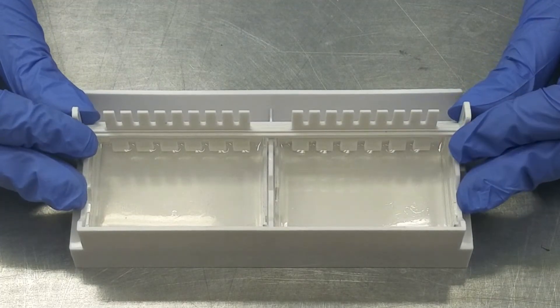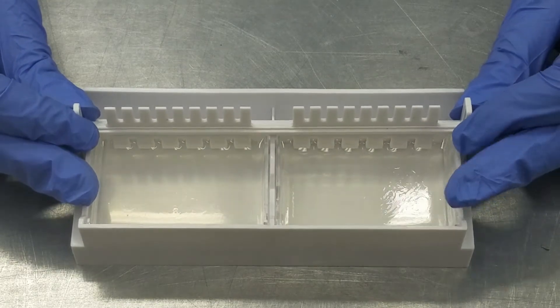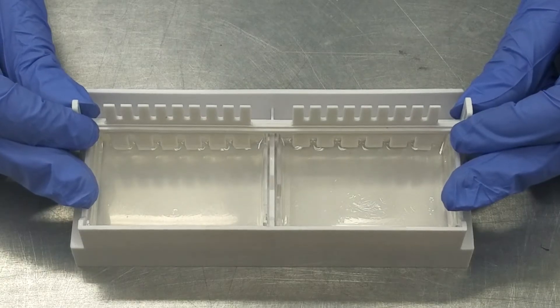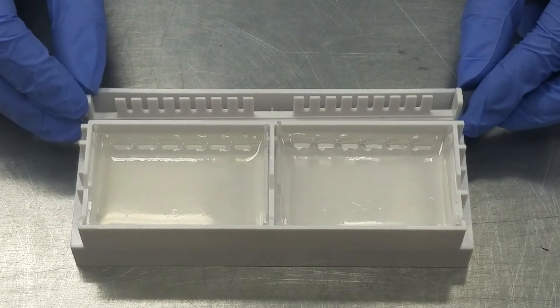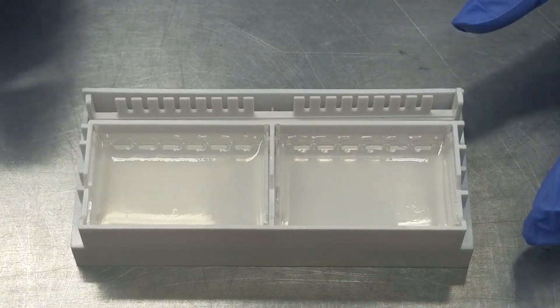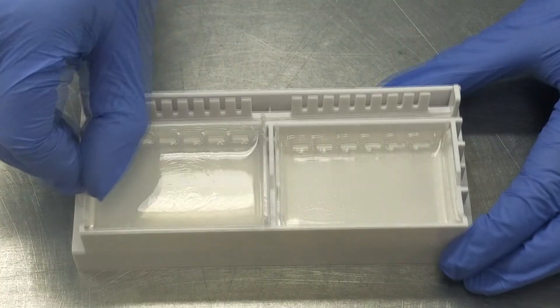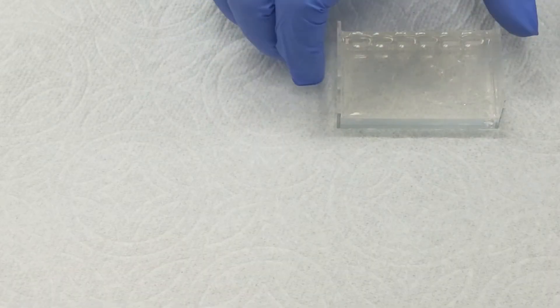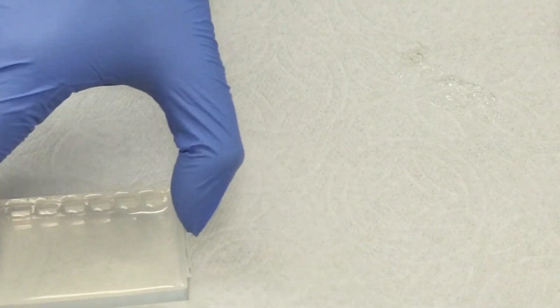Remove the gel comb by holding the casting stand down, wiggling the comb slightly while you do so. A suction may be pulled, so make sure you do this step slowly. To remove the casting tray from the stand, hold the side of the casting tray and pull up. Wipe the bottom of the gel casting tray on a paper towel to remove any excess agarose gel. Do not wipe the sides off.